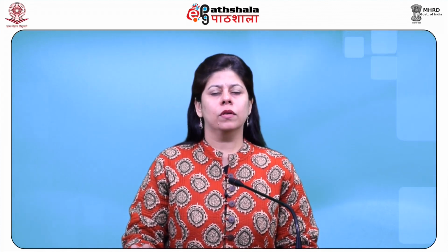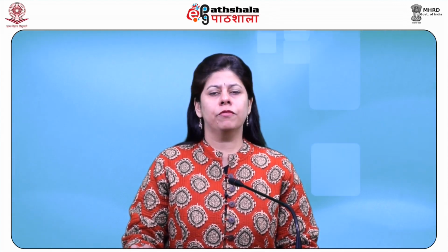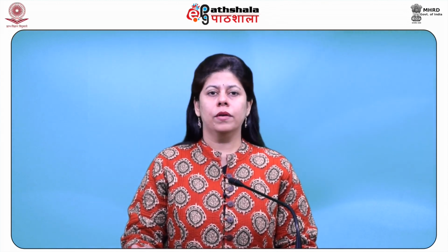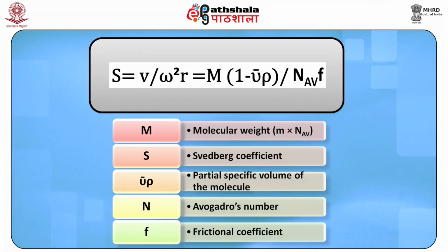The value for a molecular sedimentation velocity in a centrifugal field is called its Svedberg constant, or S. You can see the calculation of the S expression given here, where M is the molecular weight, S is the Svedberg coefficient, v-bar is the partial specific volume of the molecule, N is Avogadro's number, and f is the frictional coefficient.